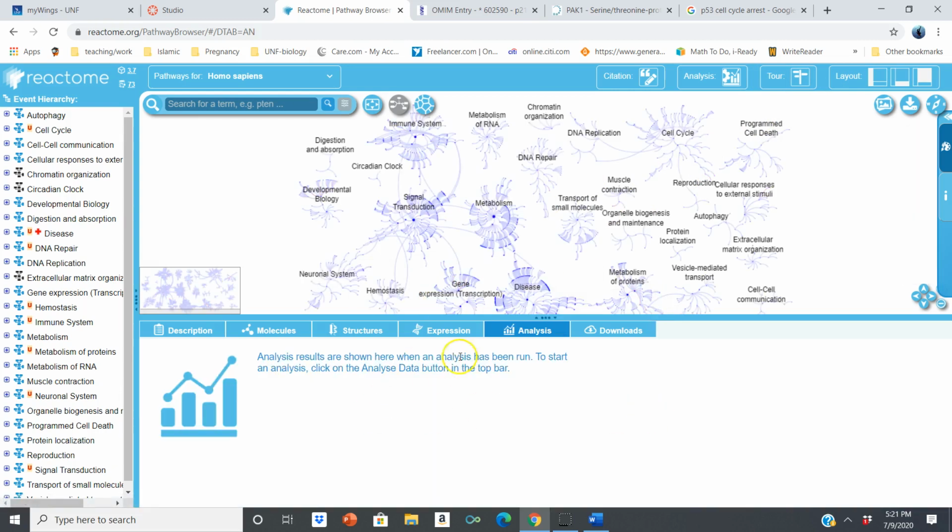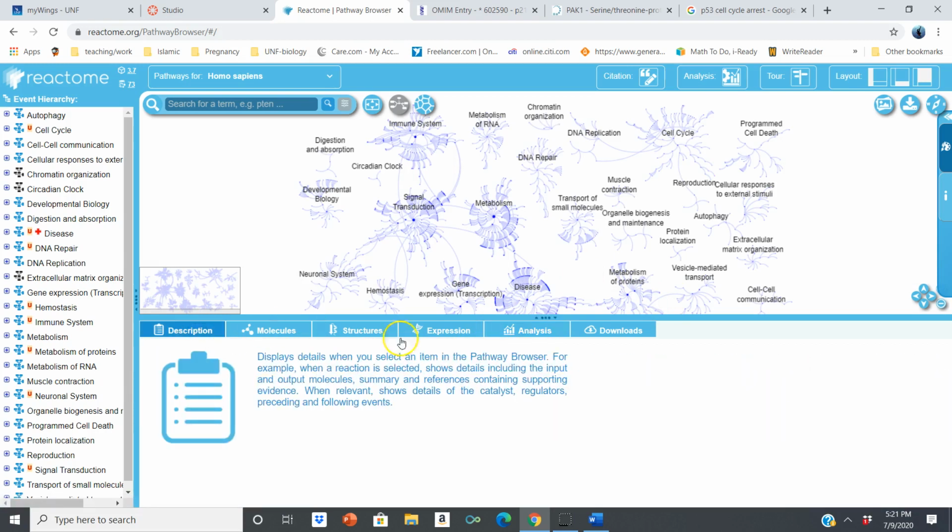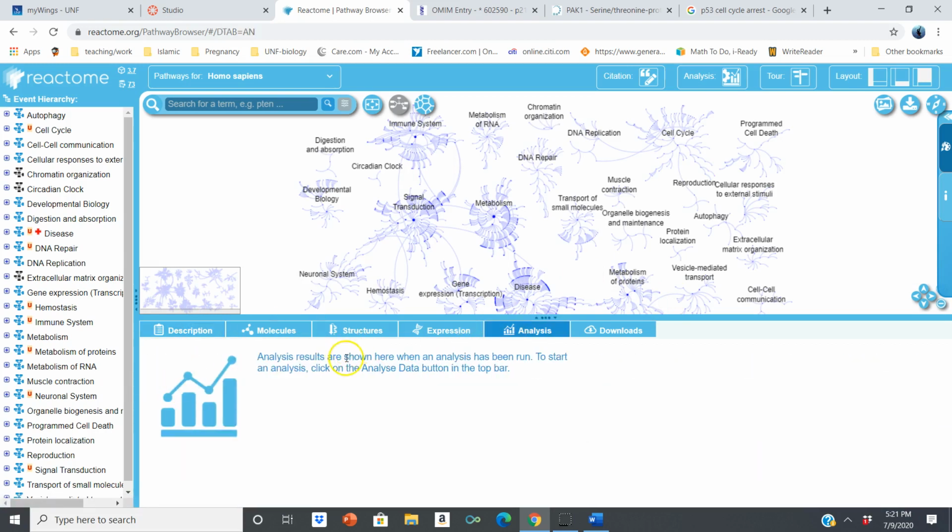You also had the p-values in there associated with that as well. I actually clicked out of it, unfortunately, so I'll fix that.